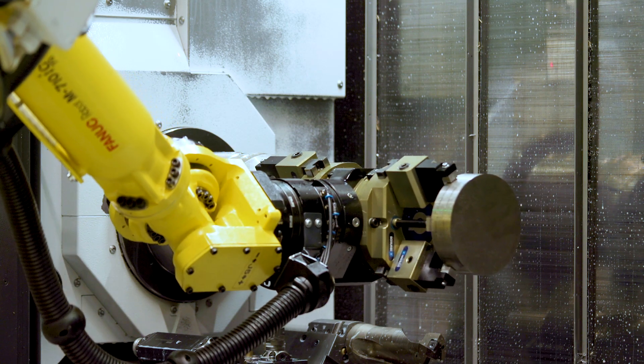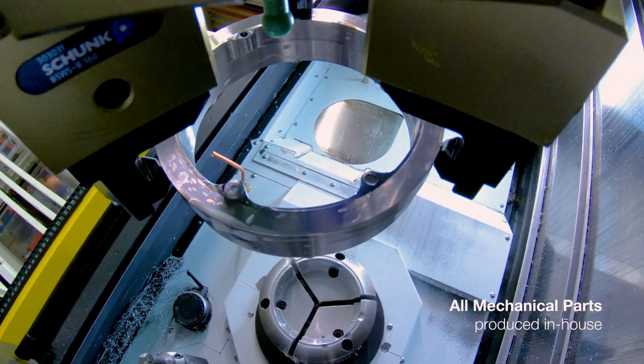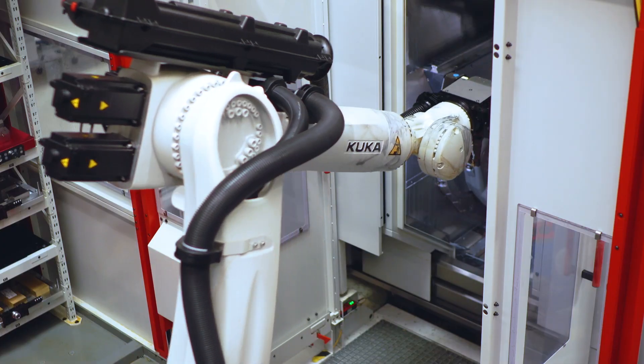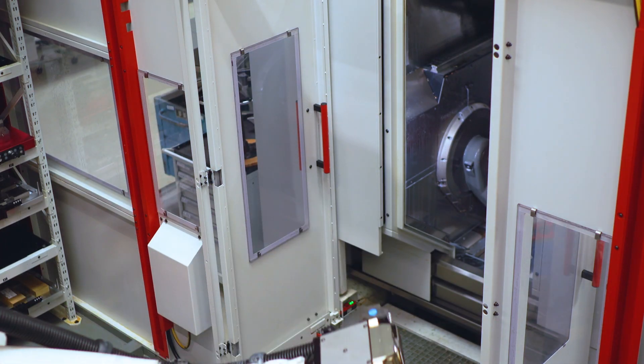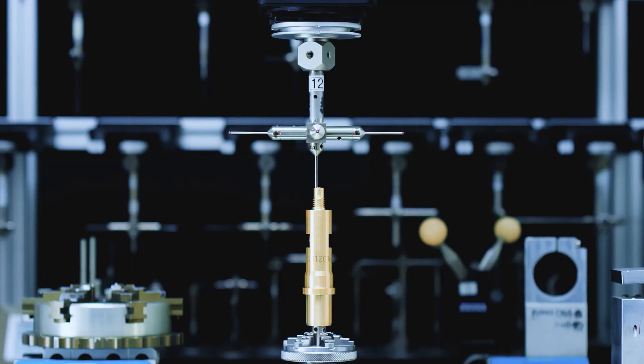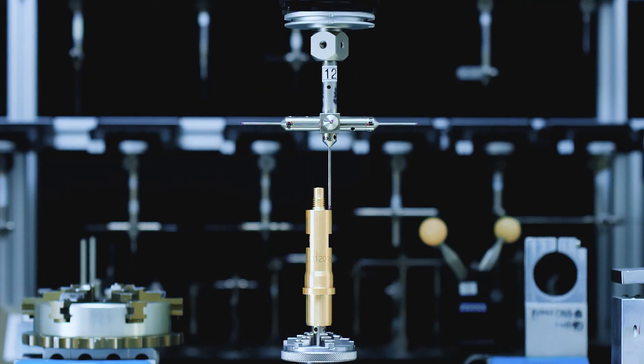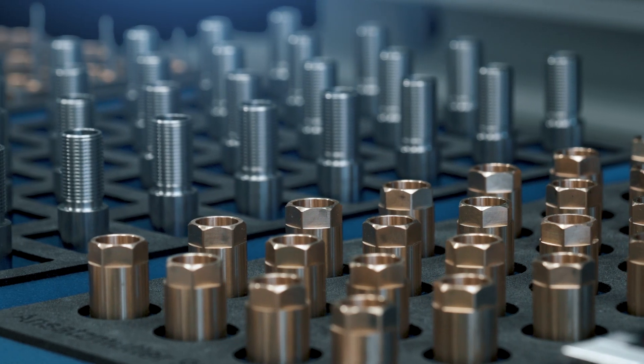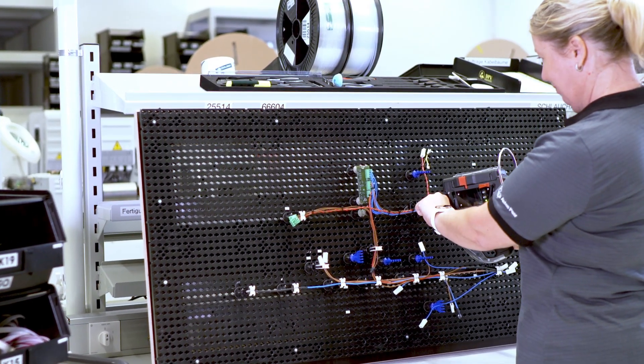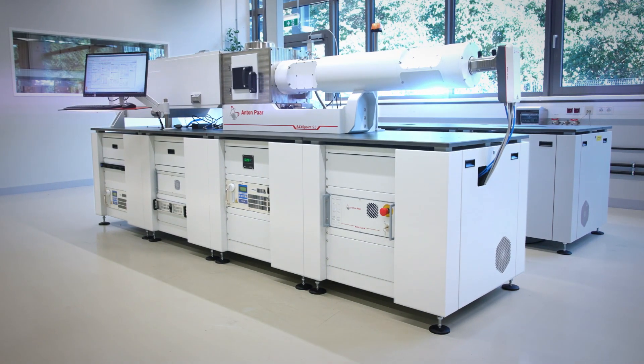And high-precision manufacturing is in our DNA. Every one of the mechanical parts that make up SAXSpoint 5.0 is made in our high-tech production facilities in Austria and at AXO Dresden in Germany. Every inch of the housing, every screw, every cable. Because we know 100% quality requires 100% control.